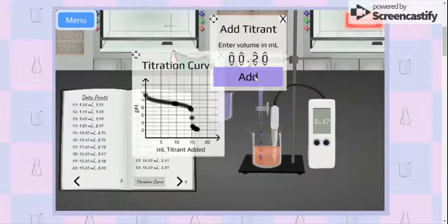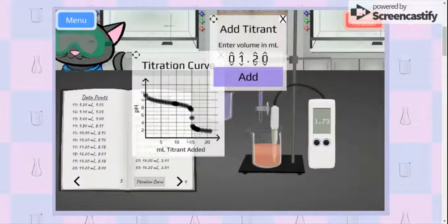So the difference here is that I have now got a higher pH to start off with because it's more concentrated, and I needed more acid to get the same amount of moles of acid to neutralize my base. Have fun exploring using the unknown base.